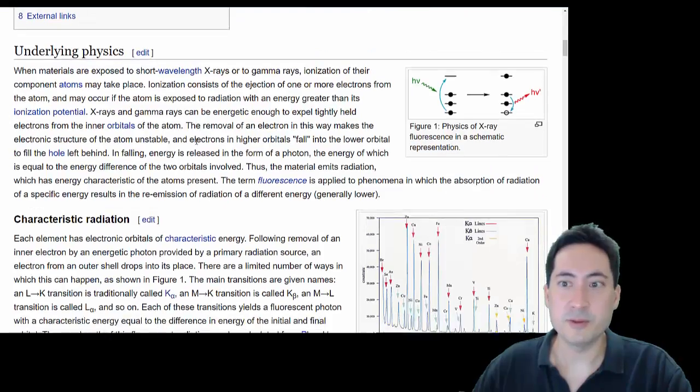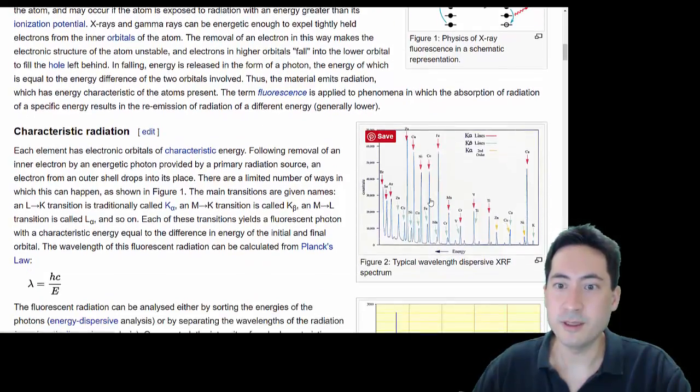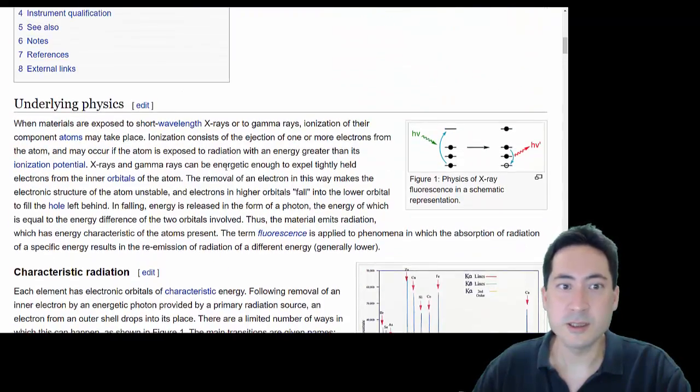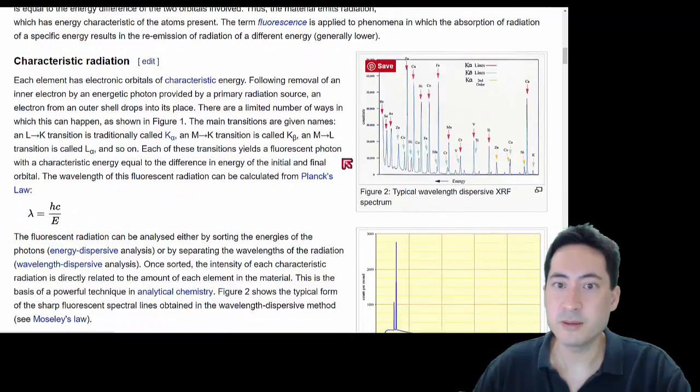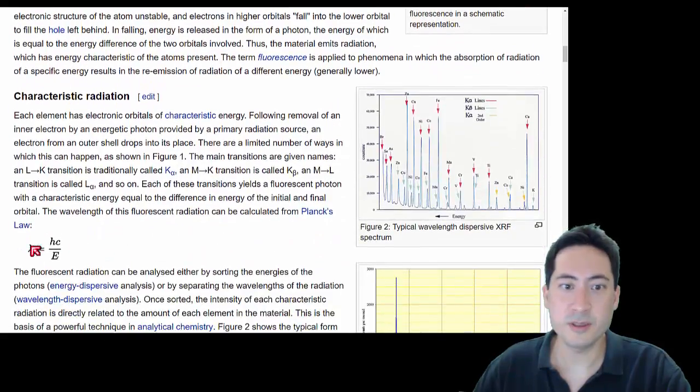Explain this. So this is probably the first topic 2 IA or extended essay I've ever seen, and it's really quite a good one. I didn't really know that you could measure the X-rays coming off and accurately, qualitatively and quantitatively measure to forensic levels the amount of elements in a substance. And so this is all part of your syllabus. You've got the excitation and release at different energy levels of the photon. That's perfect. You've got this as part of your syllabus as well.